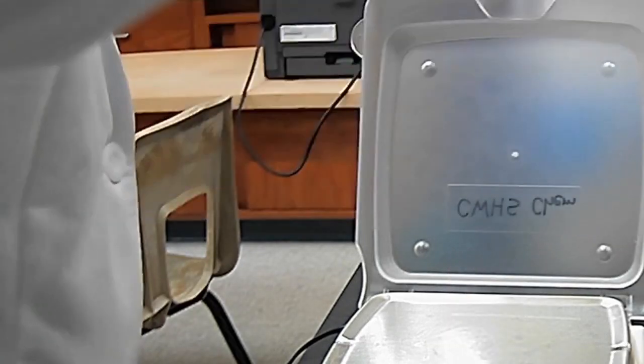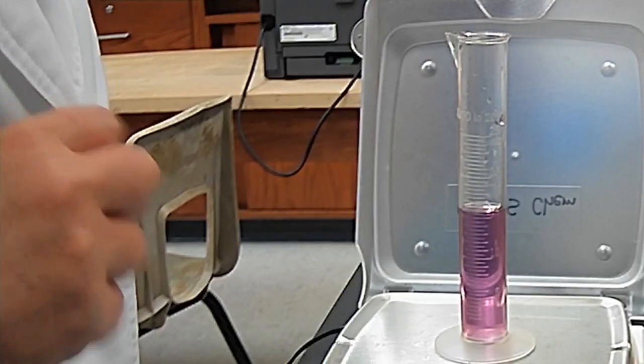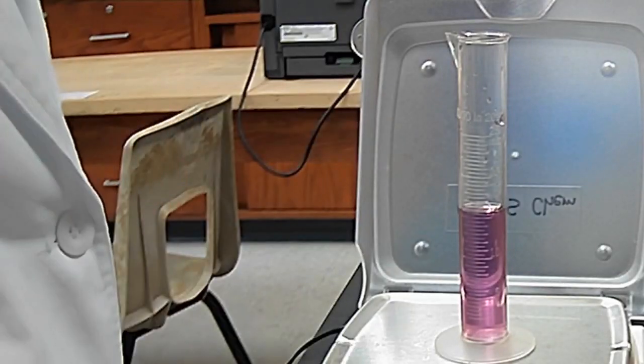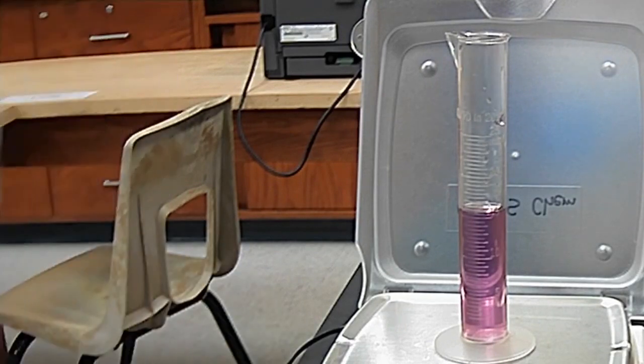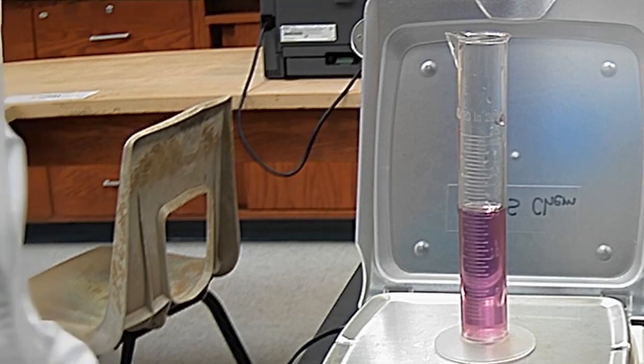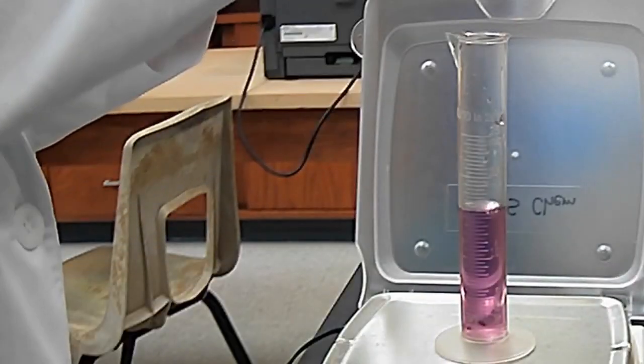Okay. Now we're going to do metal B trial 2. So this will be trial 2. We start with 15 milliliters and the mass is 25.9. Wow, I filled those pretty good. 25.9 grams we're starting off again. And then we're going to add a sample of our metal. This is metal B.